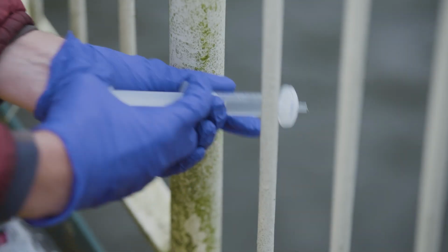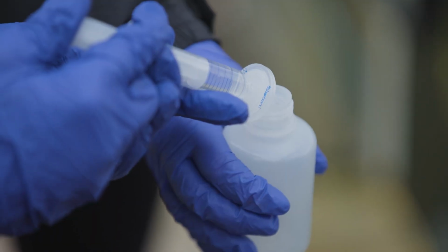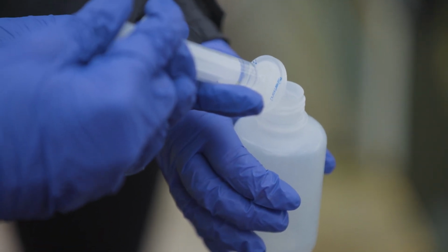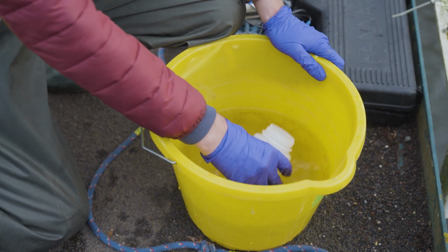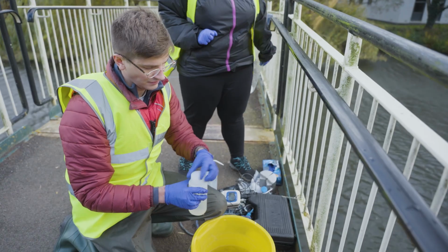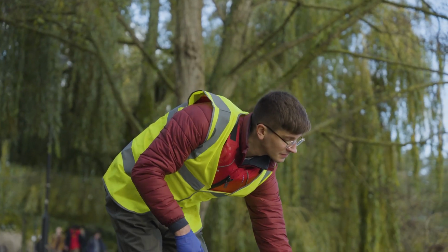If freezing samples, make sure to leave room in sample bottles to allow for the expansion of water as it freezes. Grab samples are a cheap option if your budget is limited. They're quick and you don't need extensive training or specific skills to use equipment.